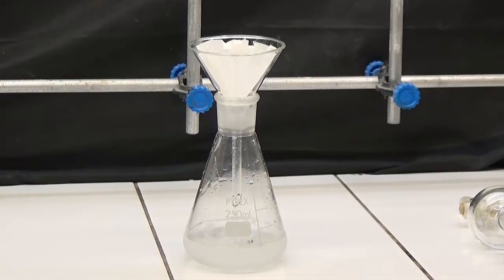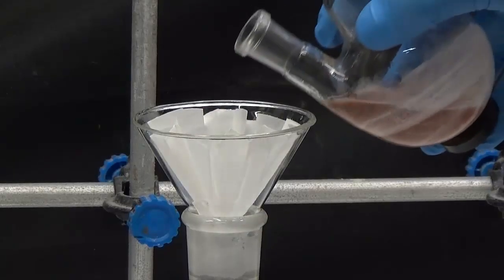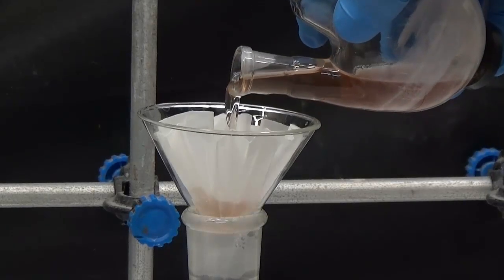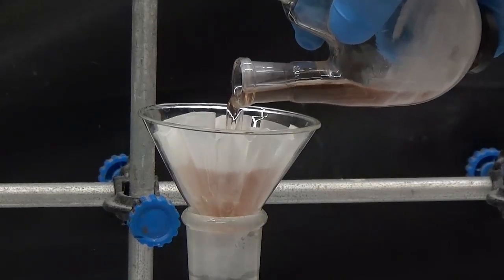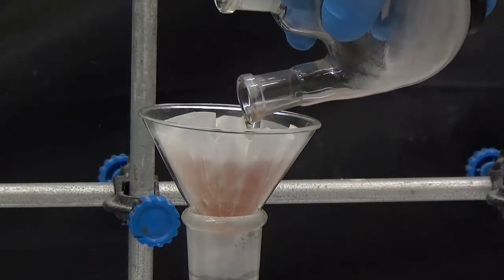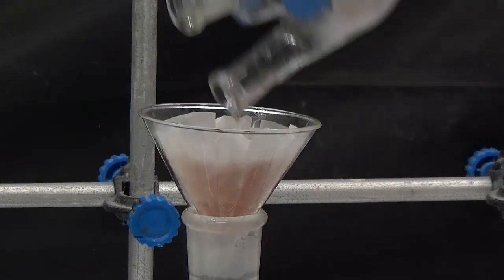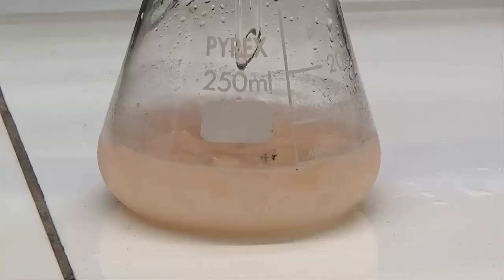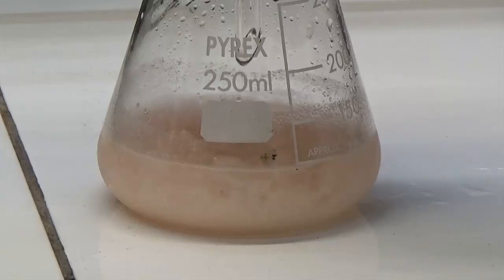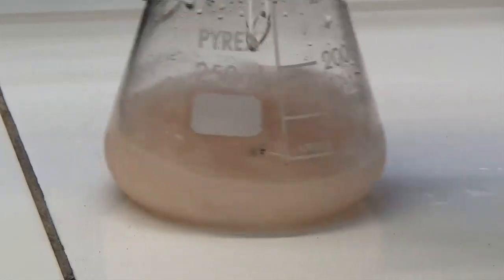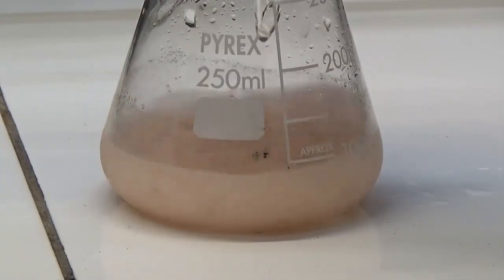Without cooling, the solution is filtered by folded paper into an Erlenmeyer flask containing 80 ml of water and ice. One observes the formation of a white phenacetin precipitate.